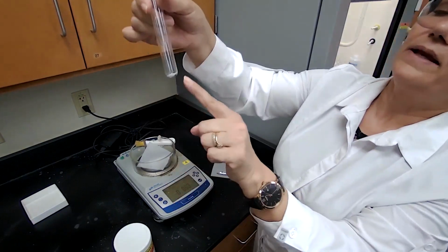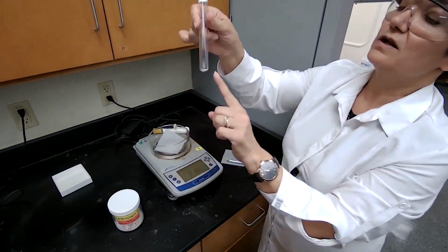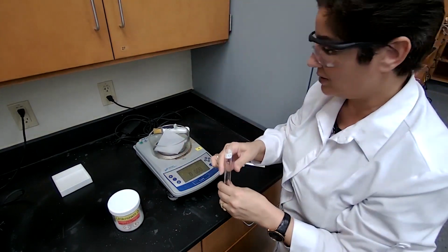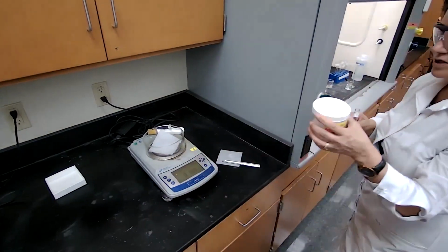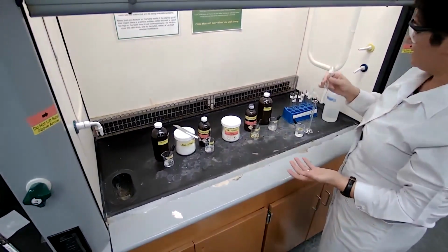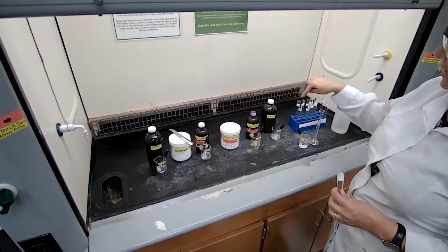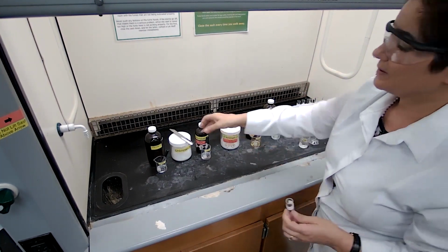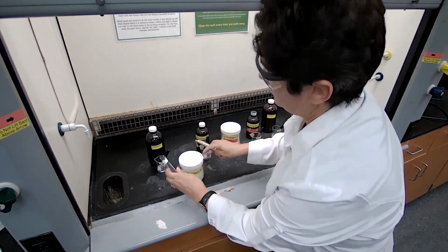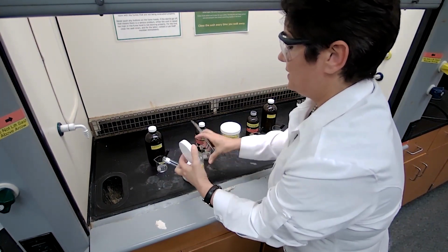So every time I'm using unknown number 3 for the solubility, I could use just the tip of a spatula of the sample. For other solubilities, I'm not measuring that. It is a qualitative analysis, not quantitative, and that's the reason I approximate about a tip of a spatula. For unknown 5, also a solid compound, I'm going to use a spatula, and I use the tip of the spatula.